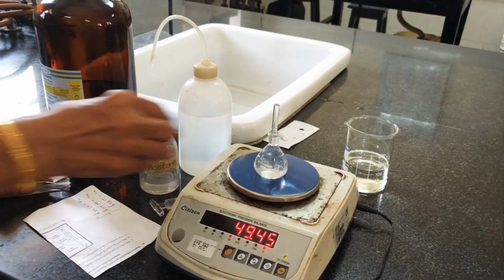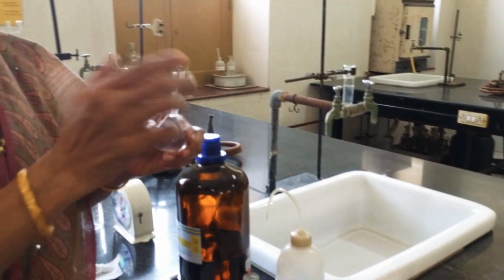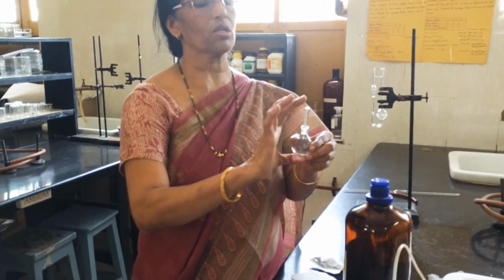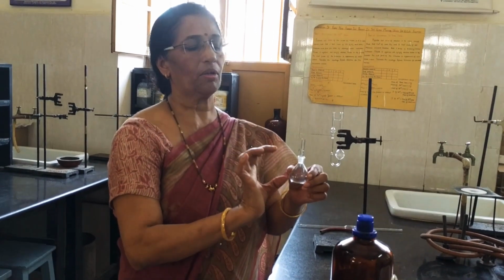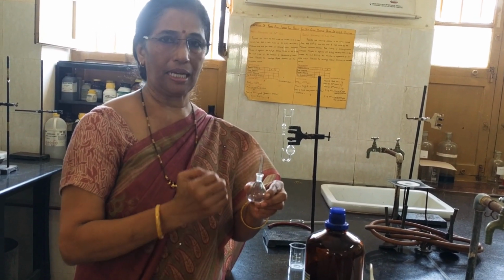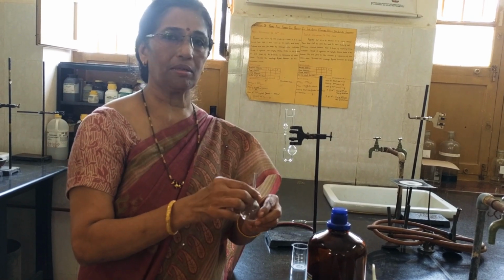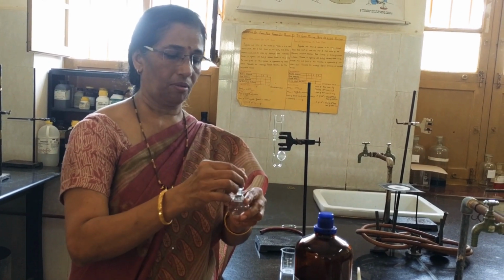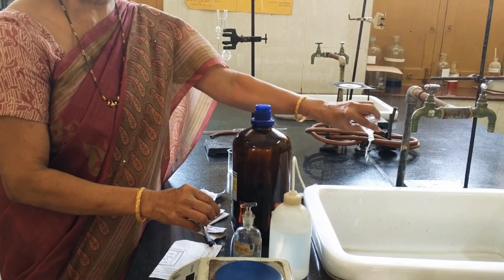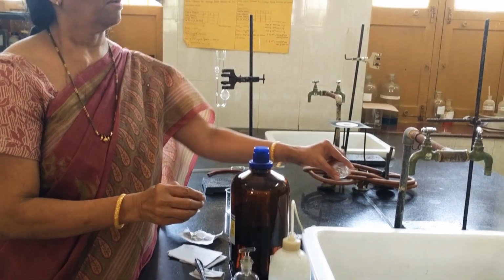Now why are we filling it with water? This is because we determine relative density. We are determining the mass of liquid, then the mass of water. We are having the same experimental conditions because into the same bottle only you have to fill the liquid. That is the reason we first find out the relative density and later determine the density of the liquid. Now let me do the calculation part. Throw the water and we are done with this density part.